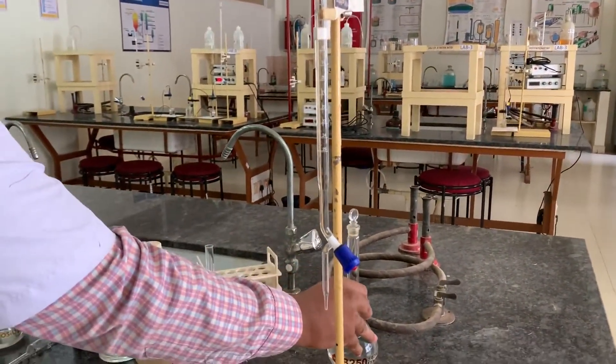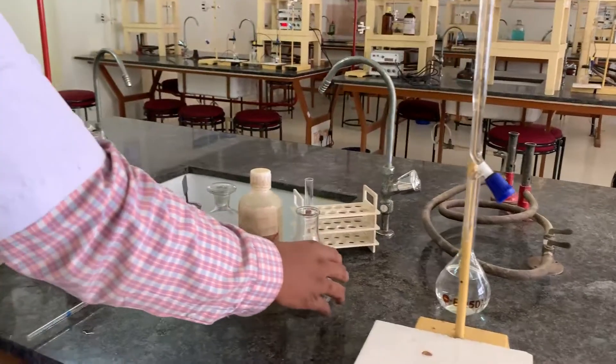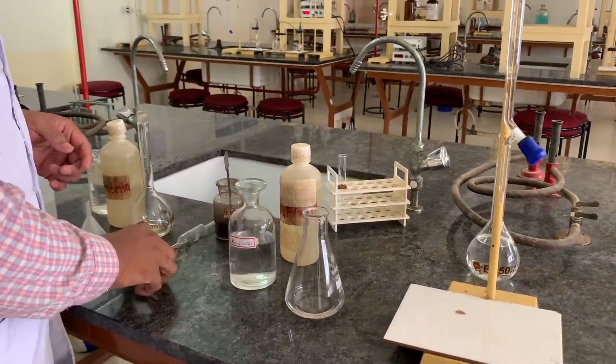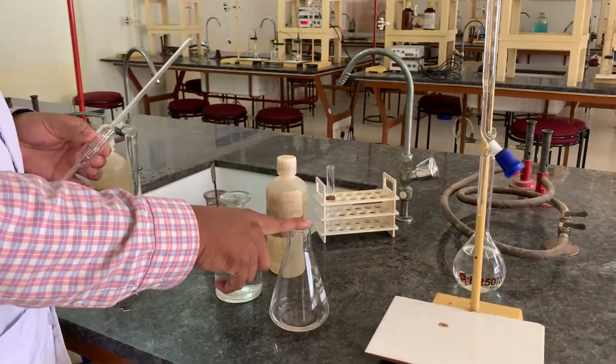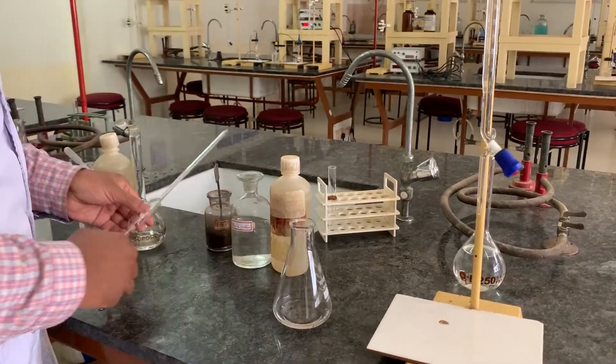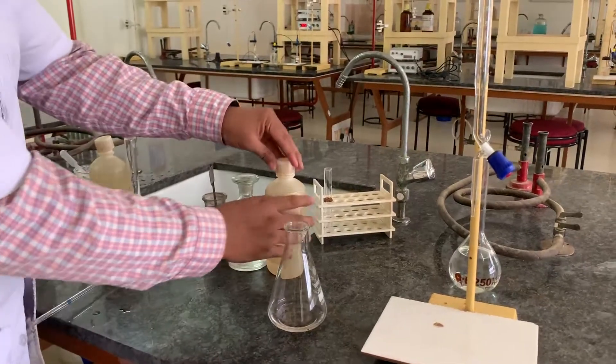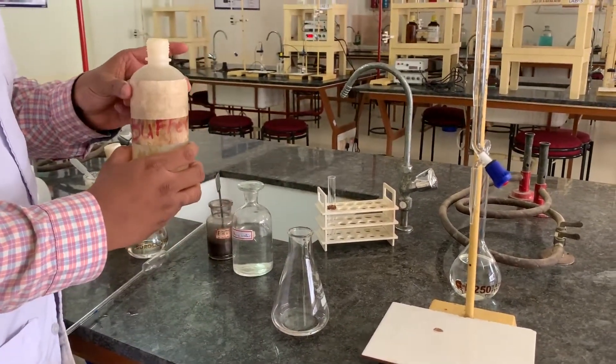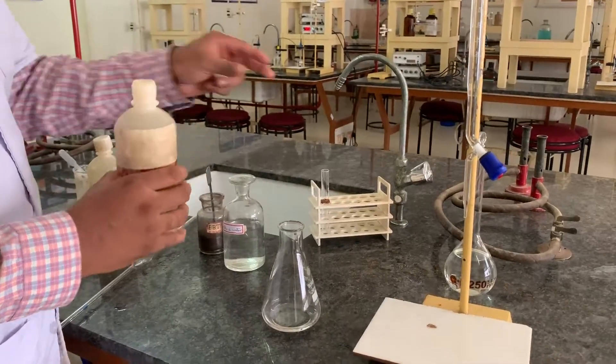Part B is concerned with the titration where we have to pipette out 25 ml of hard water using the pipette. 25 ml of hard water has been taken into the conical flask followed by 5 cm cube of buffer solution. The buffer solution used here is ammonium hydroxide, ammonium chloride buffer.